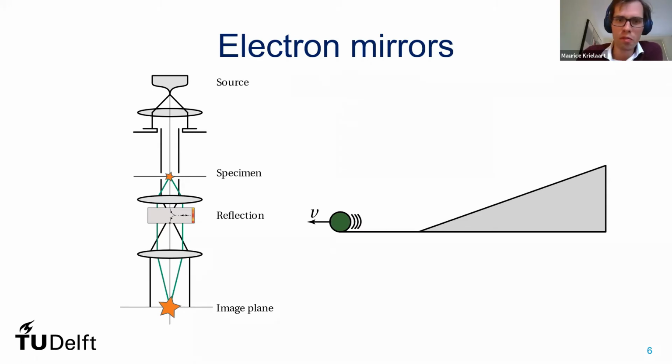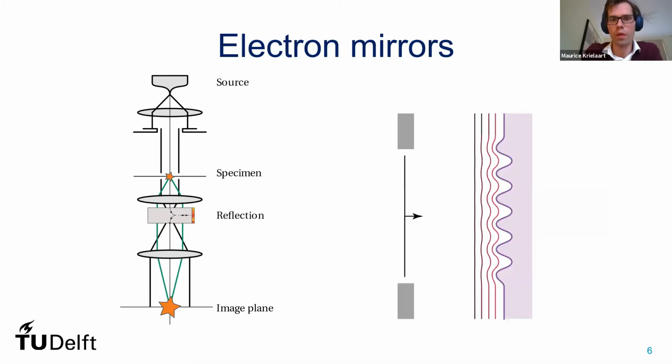So this is how basically our flat mirror would work. It would just reflect the electron and not too much happens. But now if we start thinking about having different slopes here, then all of a sudden we can get path length differences in the reflected electron. One way to get these in practice is to have your mirror electrode over here and put some pattern on it, like here I put a grating pattern that extends out of the screen, and you'll see that the equipotential lines in front, the narrow lines, will just take over that shape.